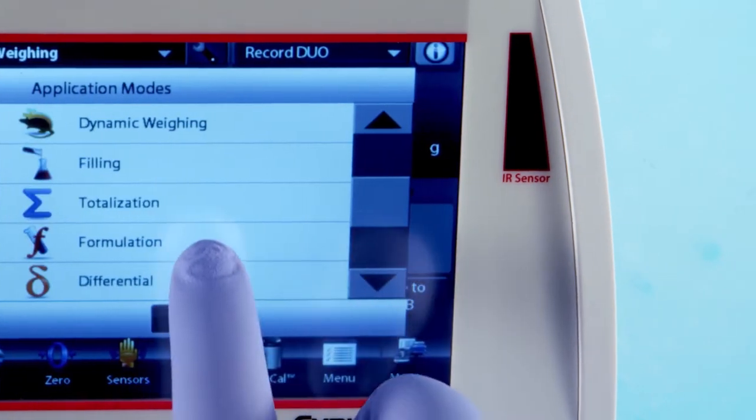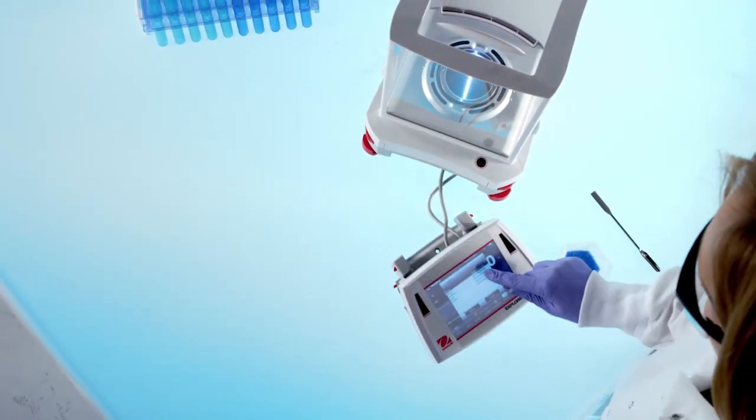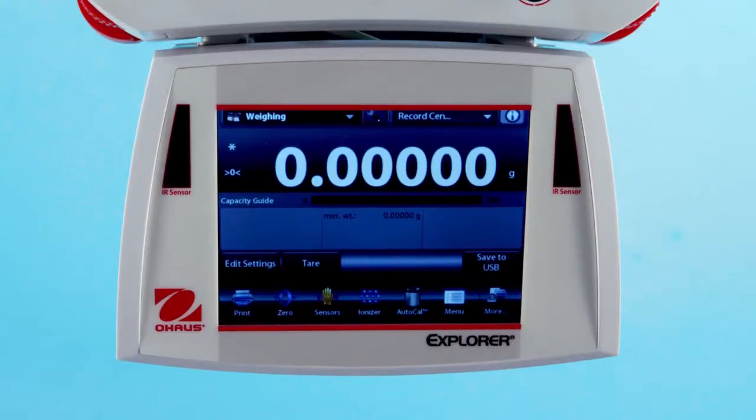Fourteen applications. Four user profiles are available: Administrator, supervisor, operator, and log viewer.